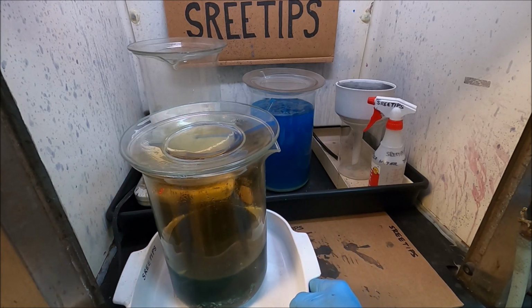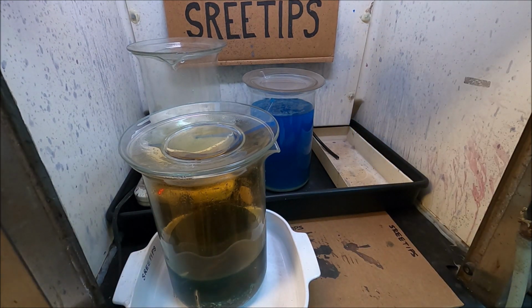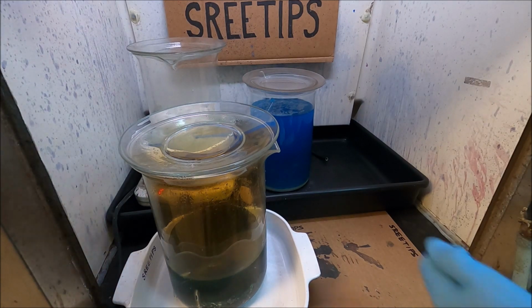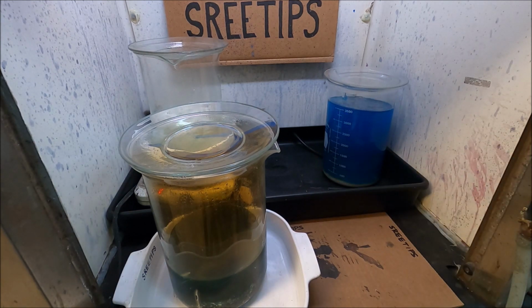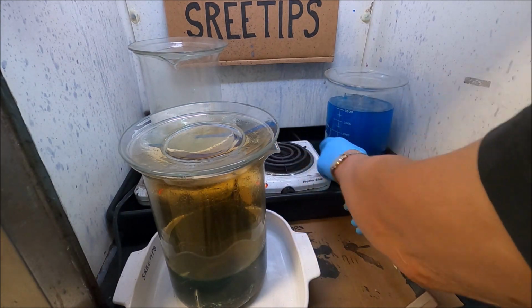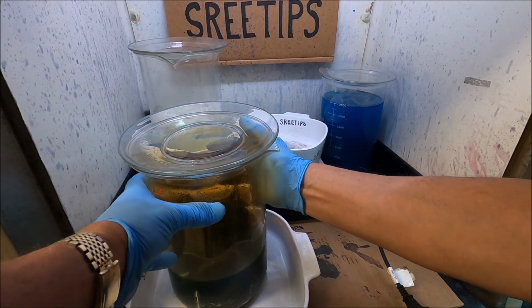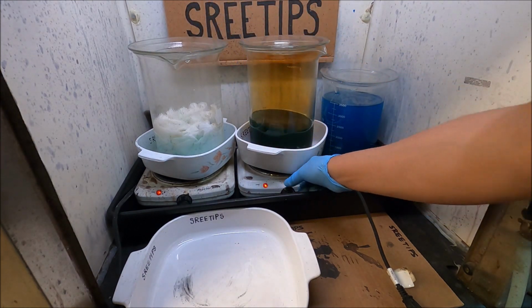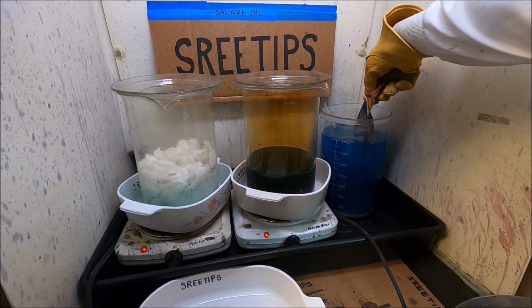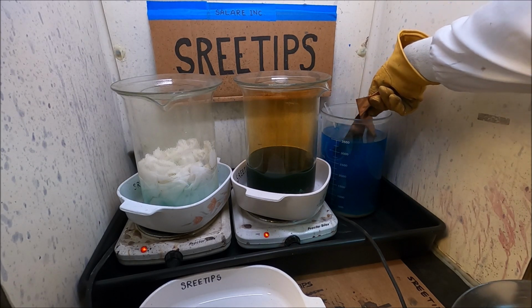Running out of room in here, so I'm going to do a little bit of rearranging. And what I want to try to do is get this beaker that I've got right here in front of me rolling real good, so I'm going to add some heat to it. I'm going to add a couple more pieces of copper to this over here to make sure we got everything cemented out of solution. As you can see by the reaction on there, there's still precious metals in solution in there.